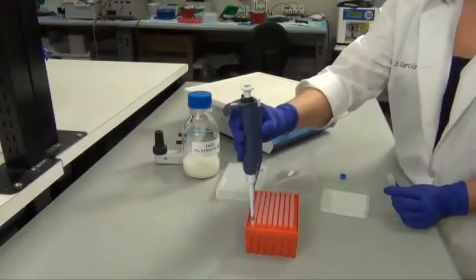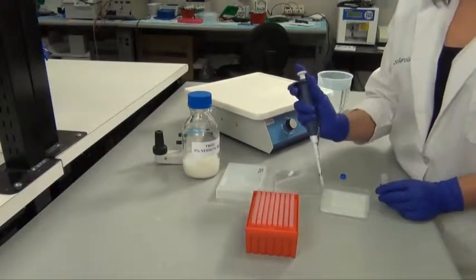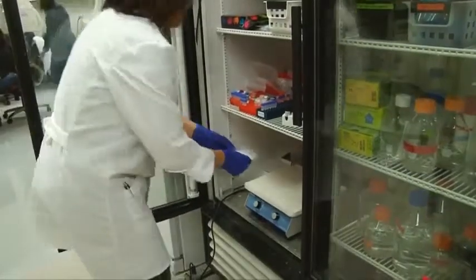We are now ready to add our antibody. Dilute the primary antibody in a blocking buffer at the concentration recommended on the datasheet, and incubate overnight at 4 degrees Celsius with gentle shaking.